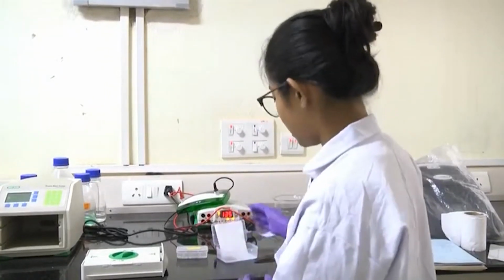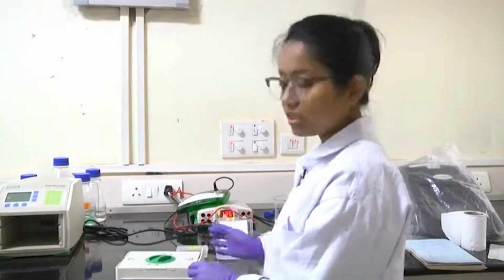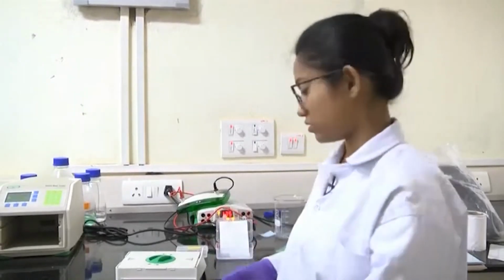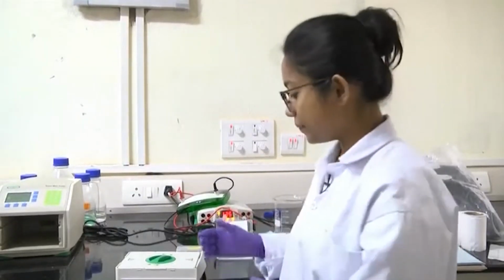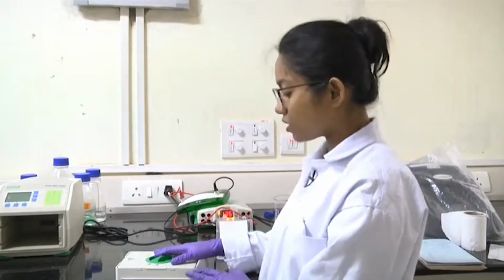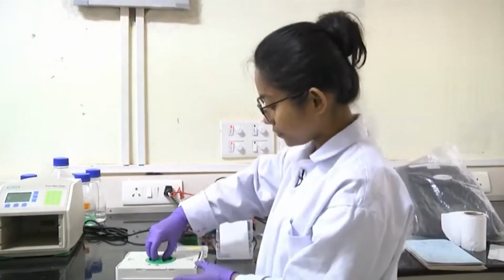After the membrane and the blotting papers are properly soaked, as I have mentioned, we are going for electrotransfer. You may opt out of the electrotransfer, but nowadays everyone goes for it because it is quicker. You don't have to wait the whole day or even more than one day. Here we will place our gel and the membrane, and due to the electric field, the protein will come out from the gel and get stuck to the membrane.